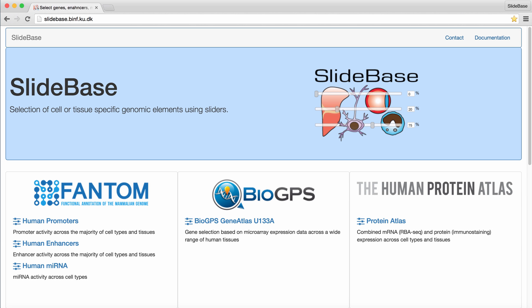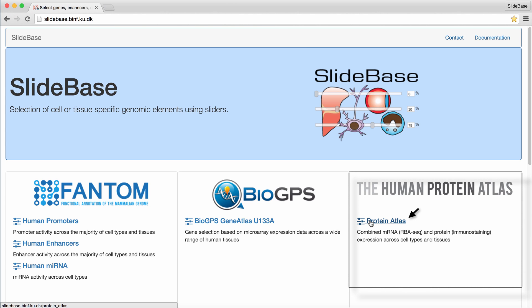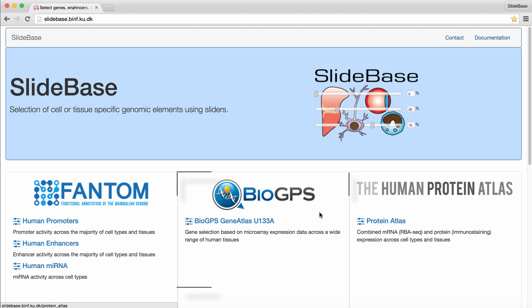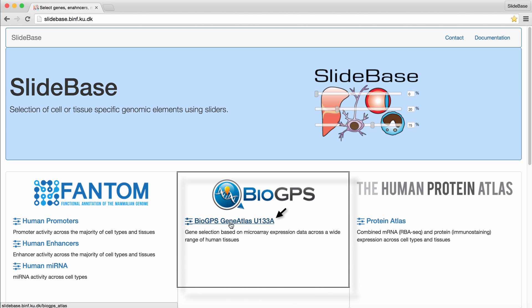The Slidebase homepage outlines the different types of gene expression data resources that we can use as a basis for selection. We include five different types of datasets. The Human Protein Atlas enables selection of genes based on either RNA-seq gene expression or protein abundance in tissues across the human body. The BioGPS Expression Atlas enables gene selection based on microarray expression data across a wide range of human cells and tissues.